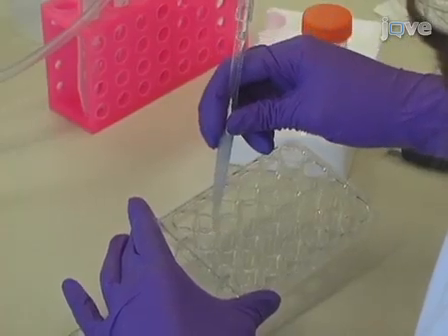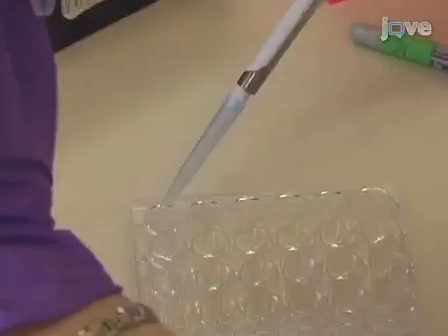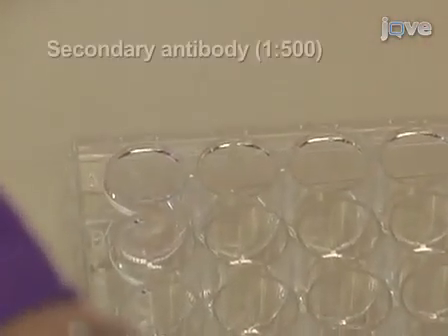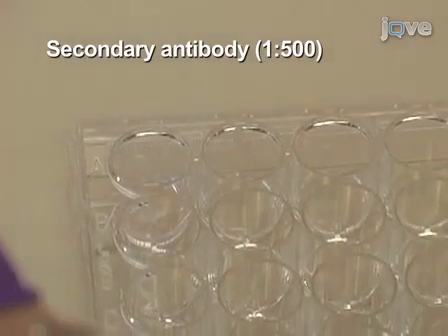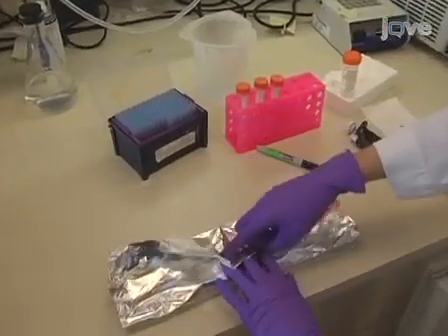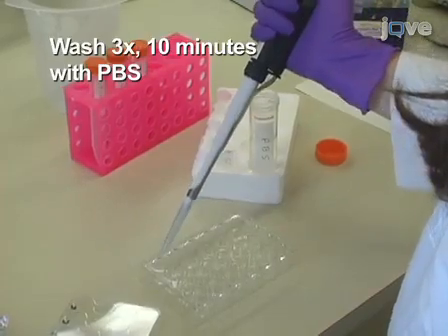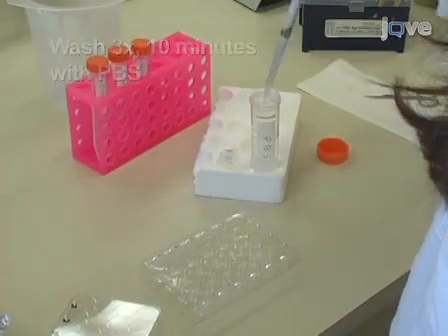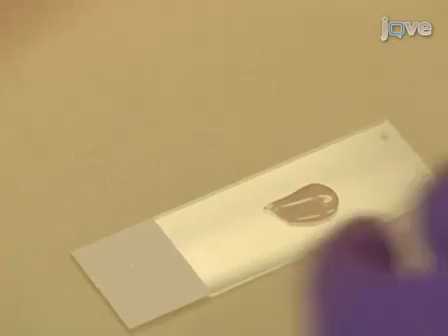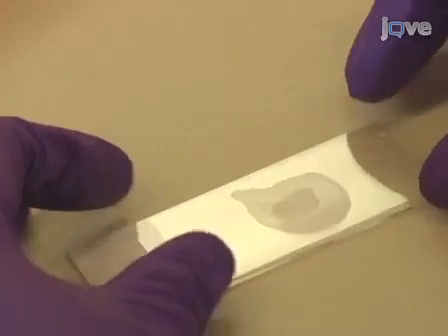The next day, aspirate the primary antibody solution and wash with PBS 3 times for 10 minutes. Then, add 250 microliters of secondary antibody diluted 1 to 500 in PBS. Cover the plate with aluminium foil to protect from light and incubate for at least 3 hours at room temperature. Following incubation, wash the slices 3 times for 10 minutes with PBS and, using mounting media that contains DAPI, mount the slices onto a glass microscope slide and cover slip.